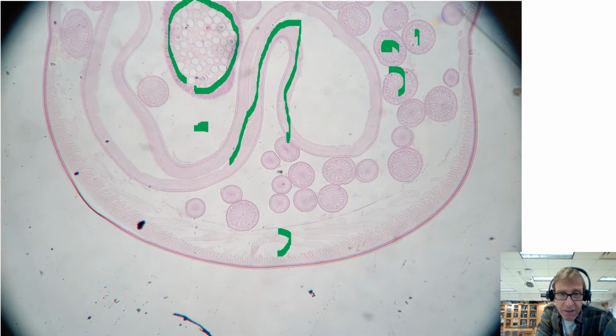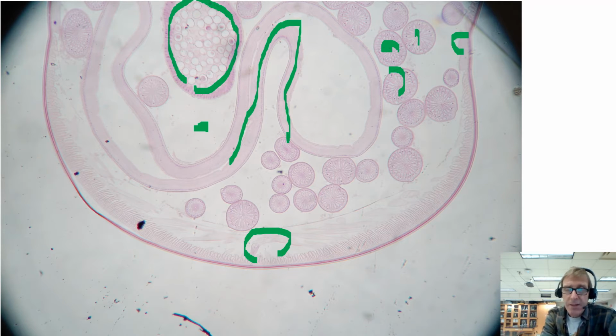And again, you'll have a ventral nerve cord here. I can't really see the lateral line as well on this one. I think it's right here. But again, this is a nematode worm. Ascaris is the genus. And you've got the male and female couple parts to identify. That's about all you need.